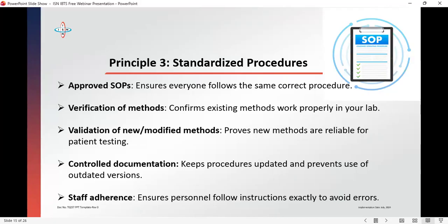Are they referenced on your own method? Did you develop that method? How did you validate it? There must be documentation of all these processes. Are the documents controlled? For instance, if your process is changed, do you have who is authorizing it? Do you have who reviews it? Do you have who approves it? Is it documented? What is the structure?